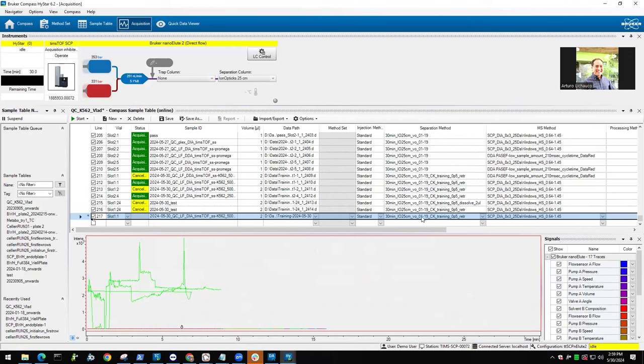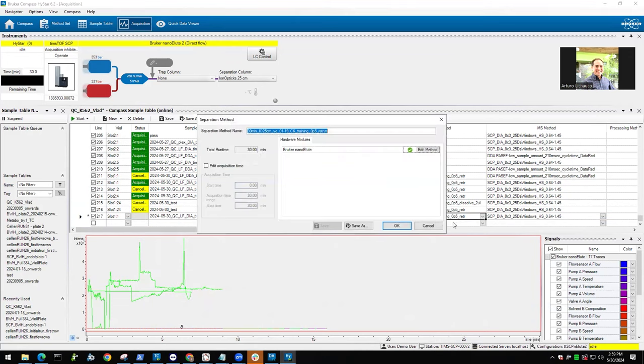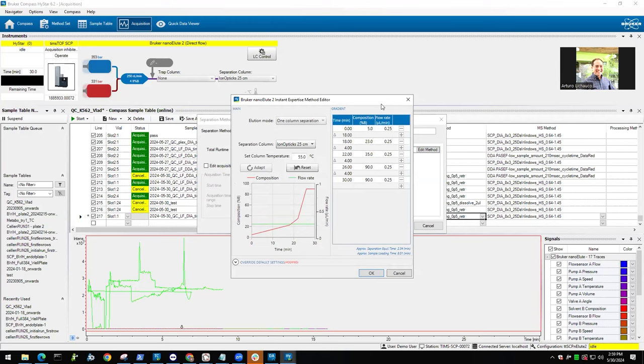And there are different modes, right? So the first way of injecting, this is where you have your sample in solution. This is our typical gradient we have here. A 25 centimeter ion optics column. It's in a column oven. We call it column toaster. It's grounded here to make sure that you have a deep spray with the ion optics column. You have to ground it at the end. And because everything is grounded, you can actually touch it. It's not that you get zapped or something. You can touch whatever you want.